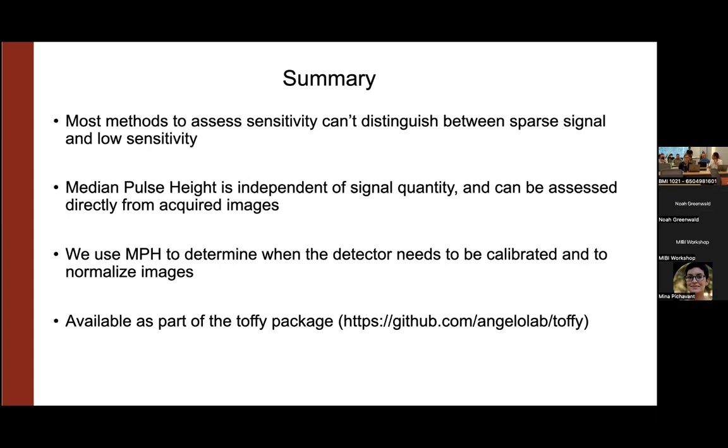Does this have to be run simultaneously while collecting your data, or can it pull this information from images that have already been collected? Yeah, so all of the information for calculating MPH is contained within the bin files. So as long as you have the bin files, which are the direct outputs, it won't work from the MIBI tiffs from the IonPath tracker because it needs the pre-unprocessed data. But as long as you have the bin files, you can always calculate this.